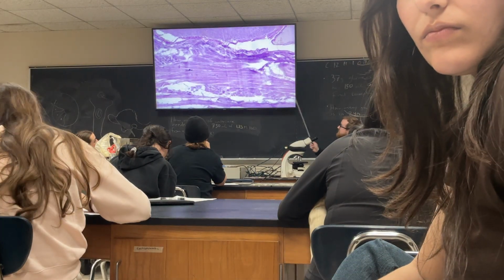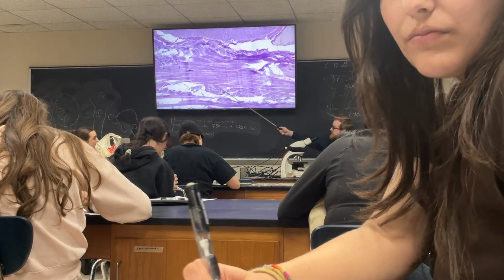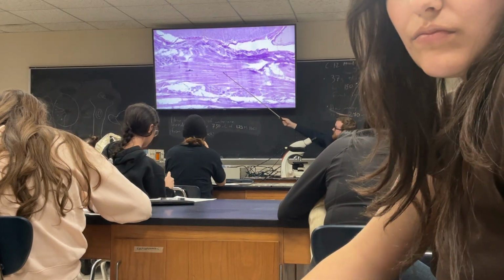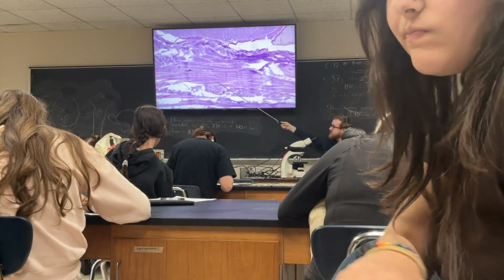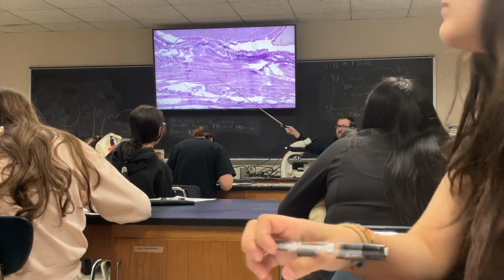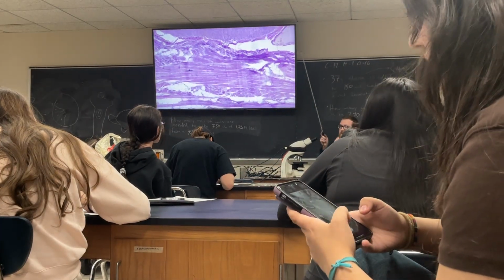These cells are huge, right? This is one cell going the whole distance across the screen. There's like 1, 2, 3, 4, 5, 6, 7, there's like 8 maybe right here, going left to right. Those are massive cells, very, very long. That's skeletal muscle. Okay.